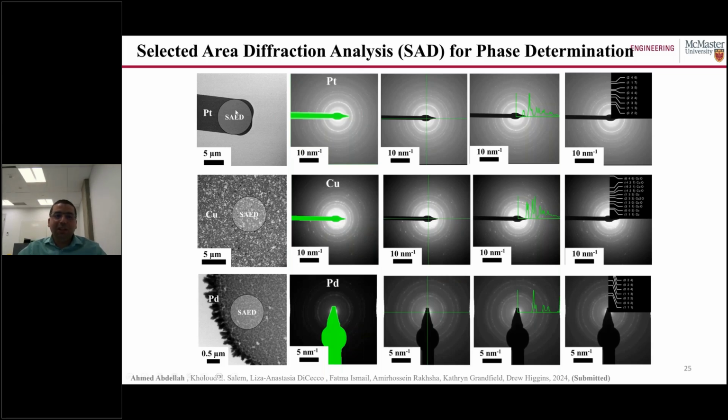First, you can try it on the platinum connector, which is an internal standard inside each chip. You can conduct electron diffraction on the platinum connector and identify that all the lattice spacings experimentally match the theoretical ones, so that you are sure the system is calibrated and everything is working well. After that, you can apply it to any catalyst you want.